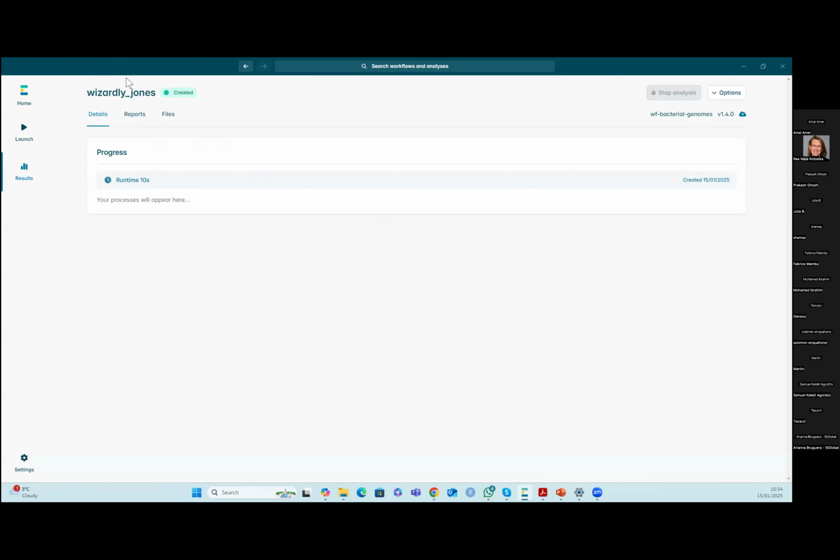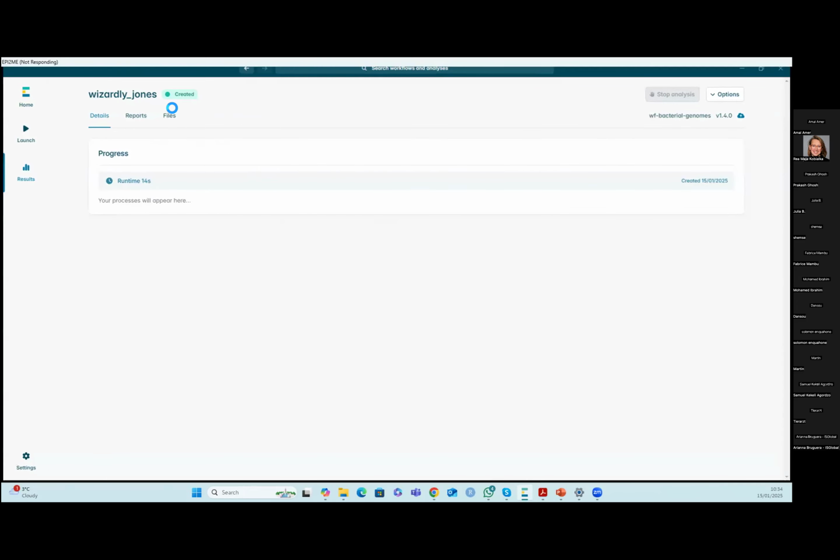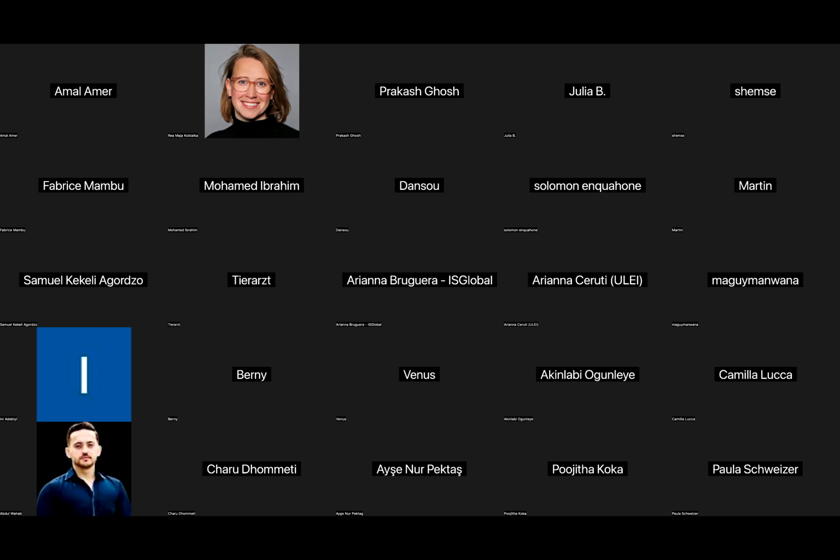Here's the name of your run. Here are the details. Here are the reports you'll get. So now I'm going to share one of the reports. How does it look?